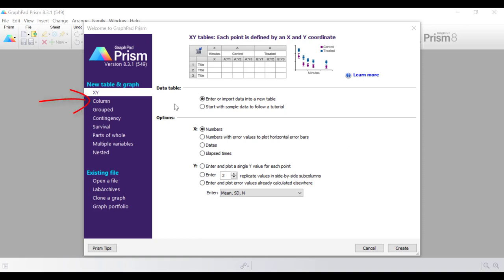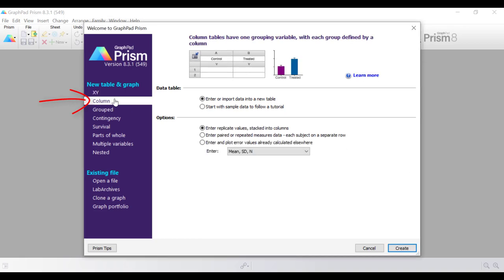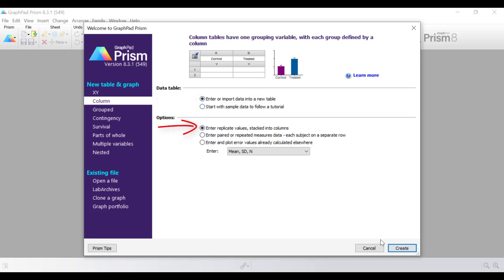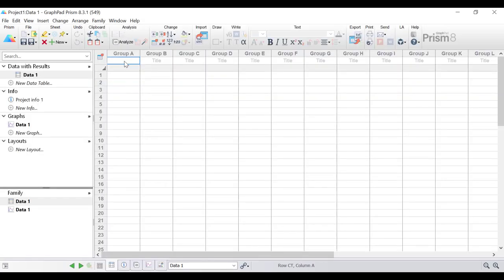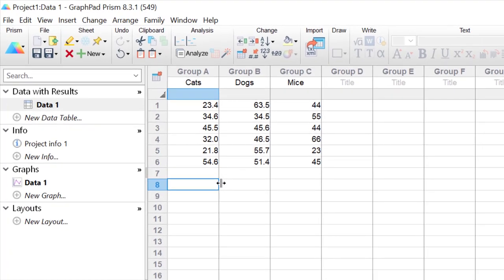For this tutorial I'm going to start by selecting a column table and graph. I'm going to enter or import data into a new table, entering replicate values stacked into columns, and then click the create button. I'll paste in the data prepared earlier. In this simple data set there are three groups — cats, dogs, and mice — with six replicates in each group.